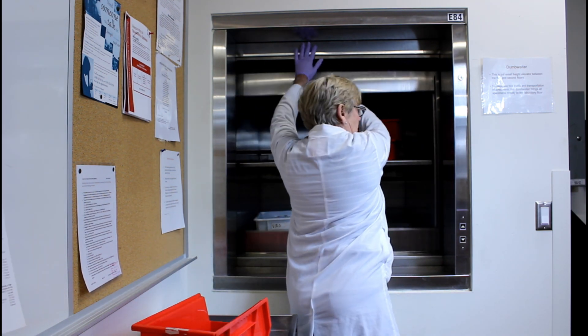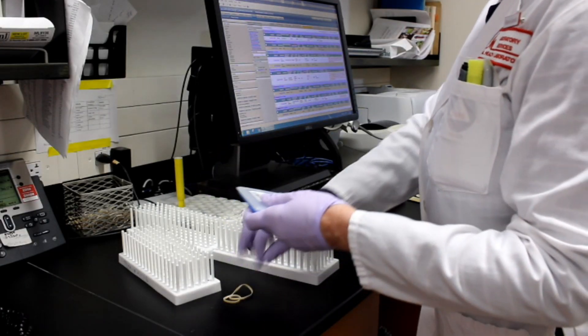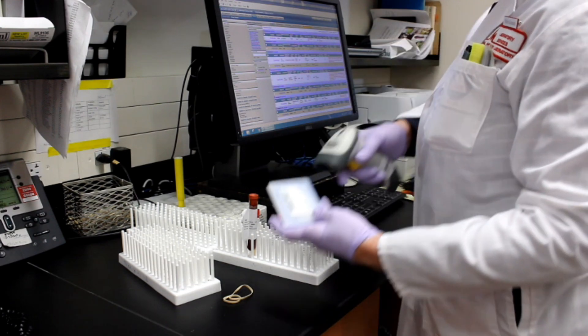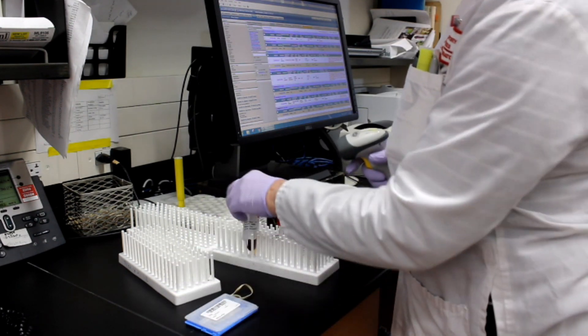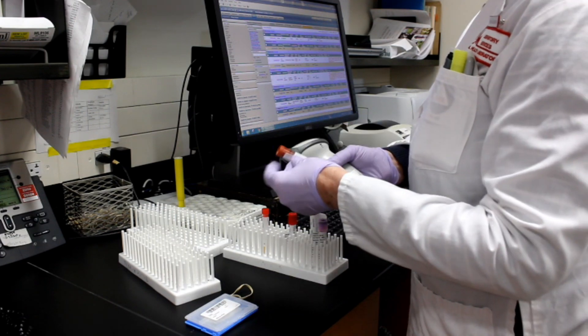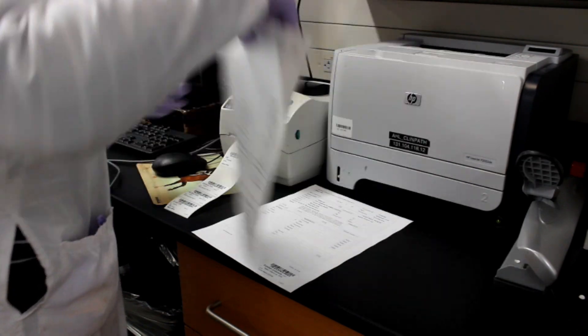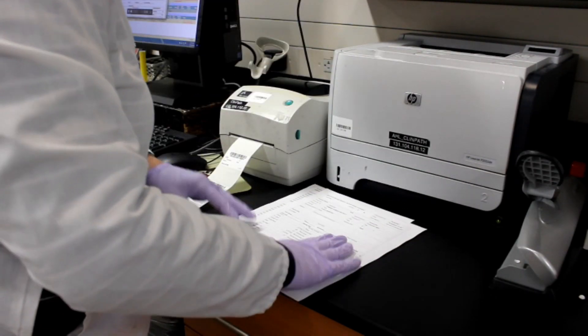Here's where we branch off into separate areas and showcase a little of what goes on in each section of our lab and how you can get the most of the samples that are sent in. Again, if you're wondering how to package samples so they're processed quickly and arrive at the lab in tip-top shape, check out our YouTube channel on packaging and shipping tips. They're also really great training videos for staff.